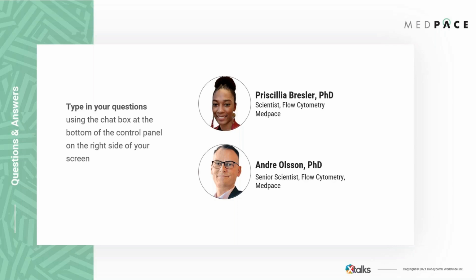Our first question is, is stability needed to be considered in RO assay? Hi, this is Priscilla. I think that I can reply to this question. Stability is important not only for receptor occupancy assay, but as well for all flow assays. At MRL, we perform different types of experiments, so I will not go into too much detail. We are looking at pre-analytical stability, so we are looking at the specimen matrix stability before staining. This is really important for the shipping condition, for example.